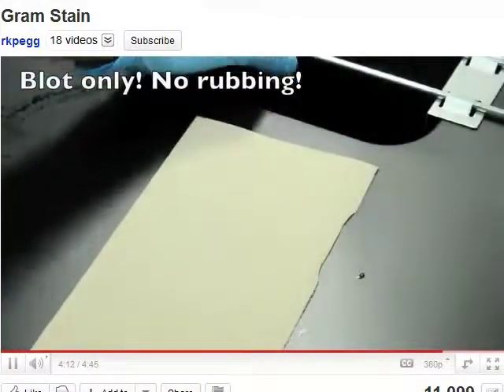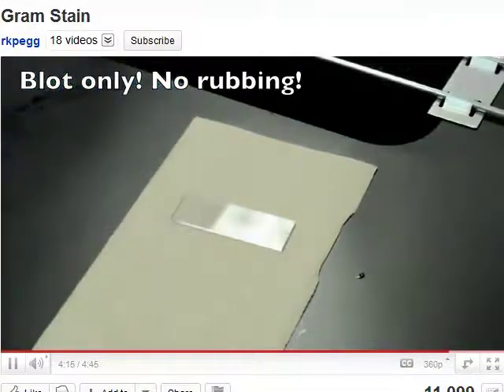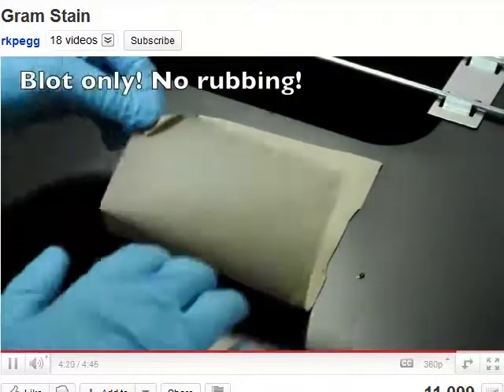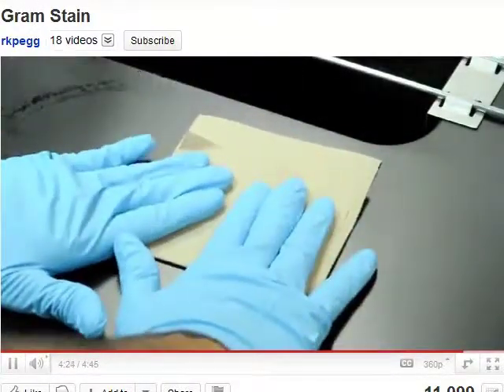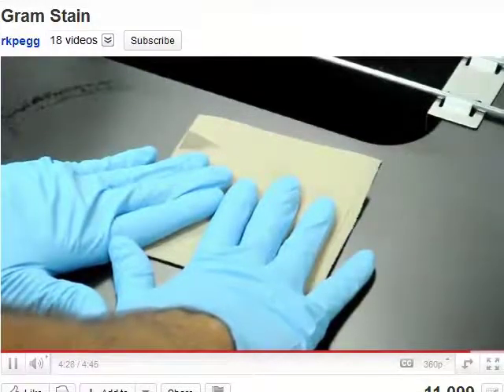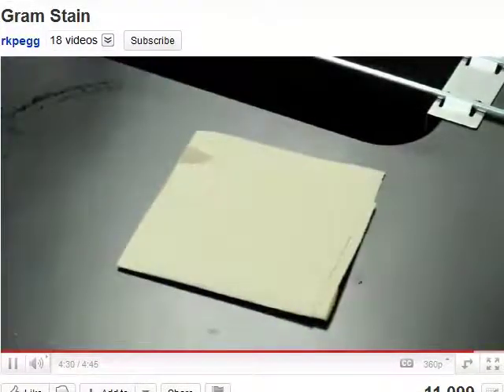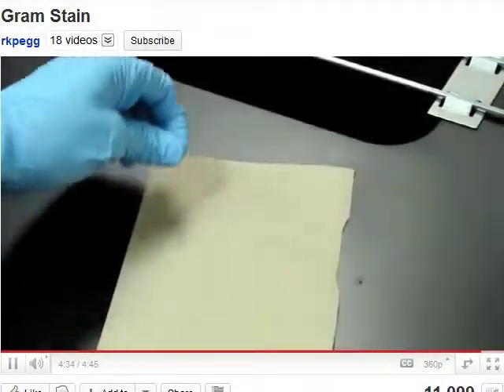Now we need to blot. And so we're going to place the slide face up onto the blotting paper. We're going to fold it over one time, and then we're going to press down. Do not rub the slide. That's very important. If you rub, you're going to rub off the specimen, which is loosely bound to the surface, and you'll have tear and streak marks. We're just going to push down and hold it down. And that's it. The procedure's done.